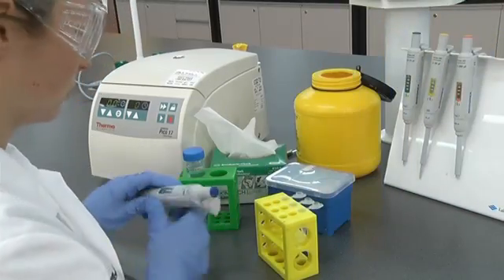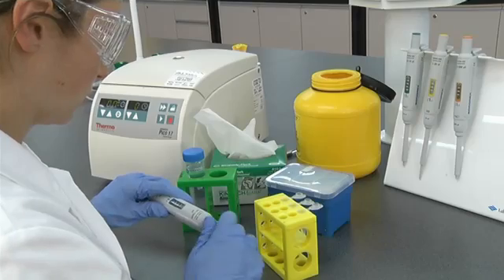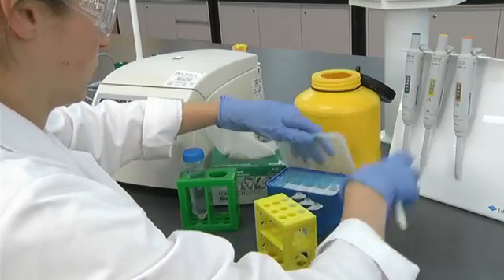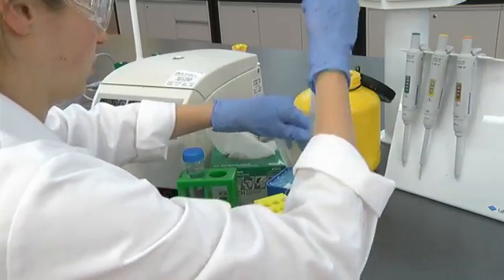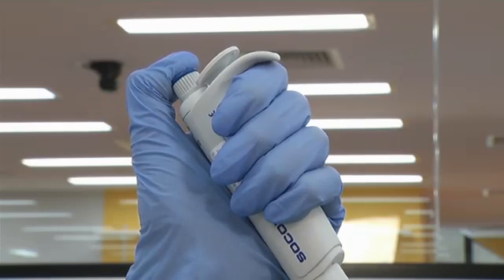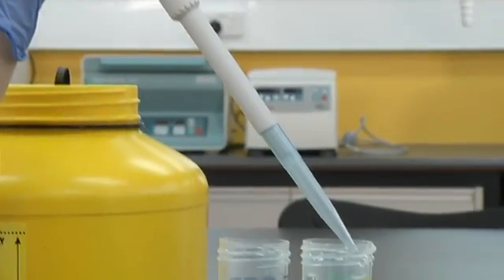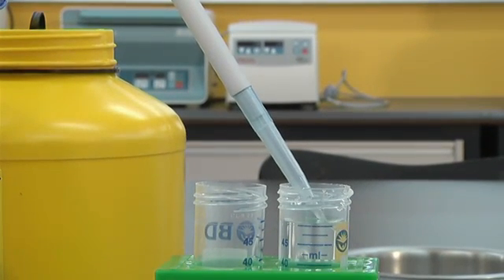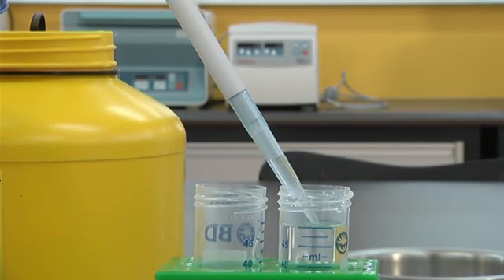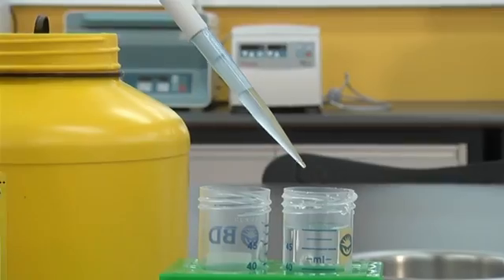Another technique for pipetting viscous solutions is called reverse pipetting. As the name implies, the action of pipetting is done in reverse. Set the volume of the pipette to the volume you desire. Initially the plunger is depressed down past the first stop to the second stop. Draw up the viscous solution slowly. A greater volume than what is set is drawn up into the tip. Obviously you can't do this if the pipette is already set to its maximum volume.